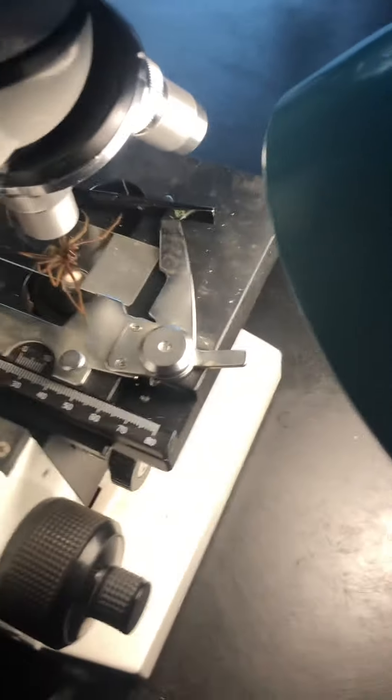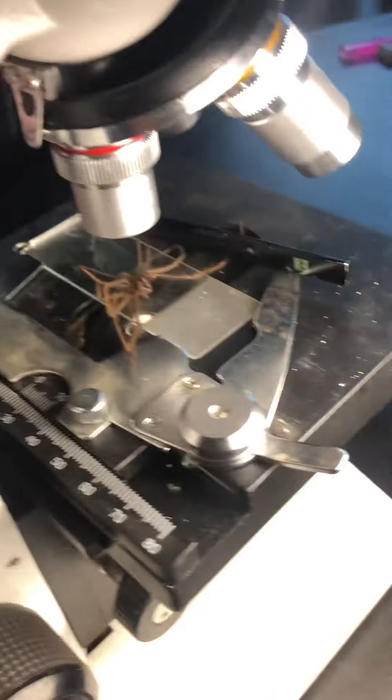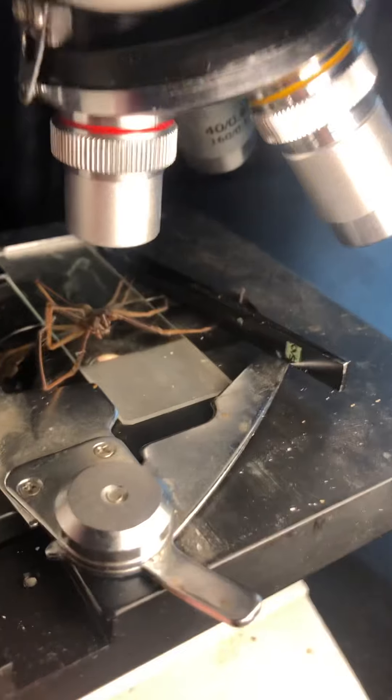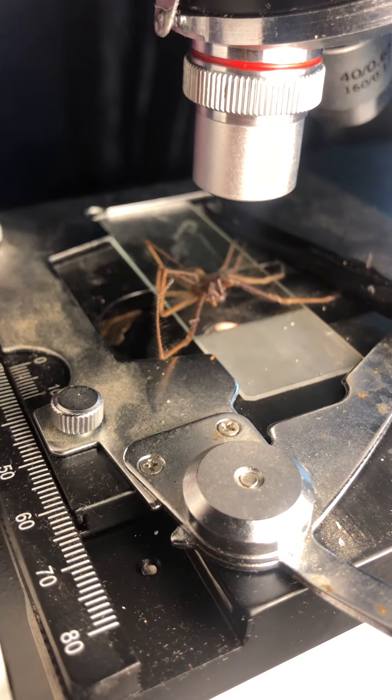A quick look down. Can I get one of the legs on? Yeah.